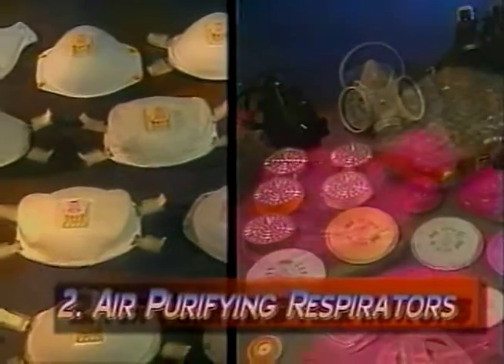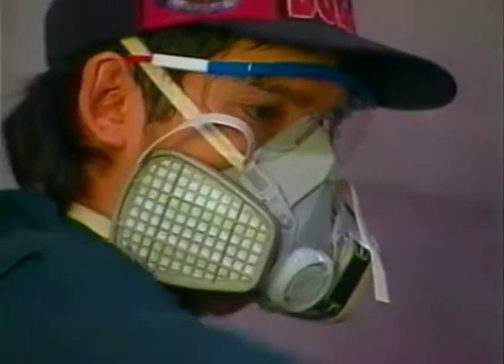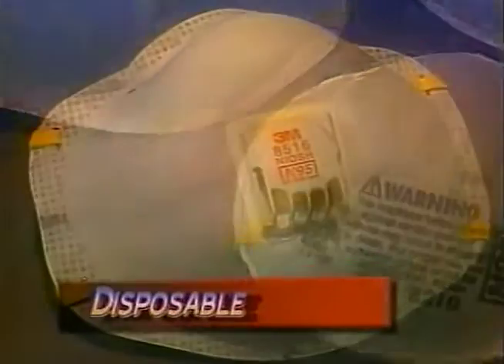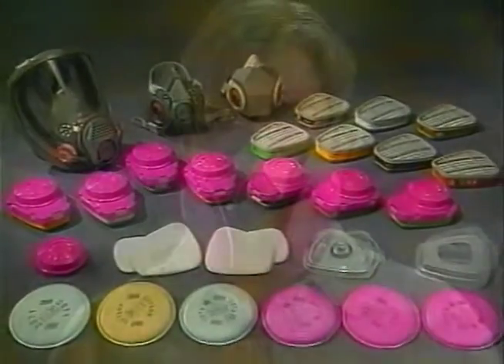Air purifying respirators are designed to filter contaminated air using different filtering media specific to the contaminants. There are many makes and models of air purifying respirators which can be grouped into two major types. They are disposable respirators and reusable respirators. Both are negative pressure respirators. This means that as the worker inhales, the pressure inside the respirator becomes negative compared to the air pressure outside.